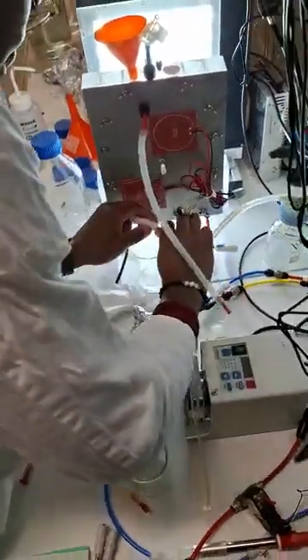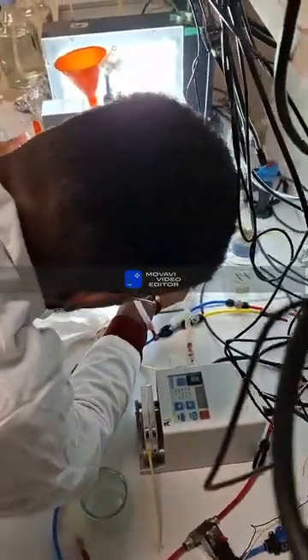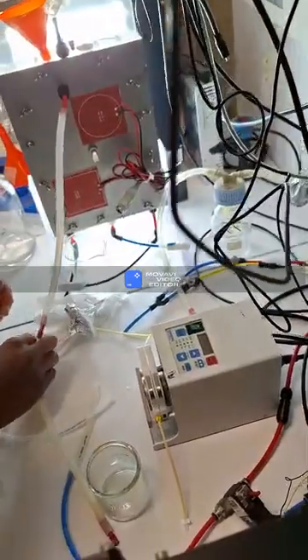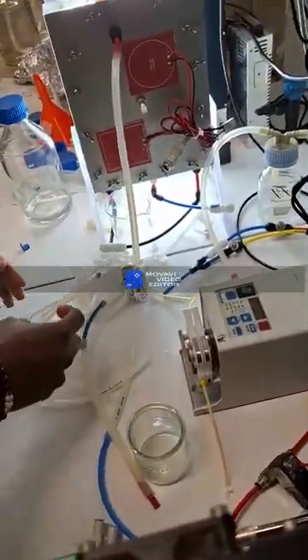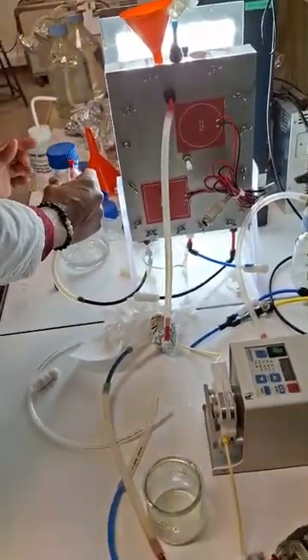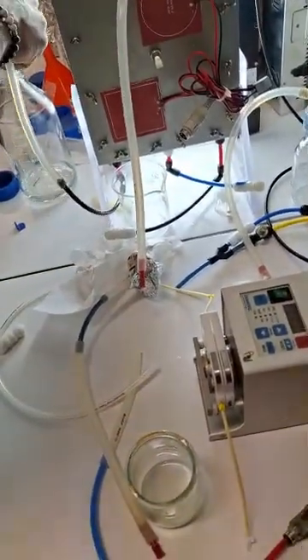Oh, I have a leak. Nobody is an expert in that. There is a leak here too. We are learning. Unfortunately, we'll have to put it back in the bottle. I will change it. It will be practice again, you know?